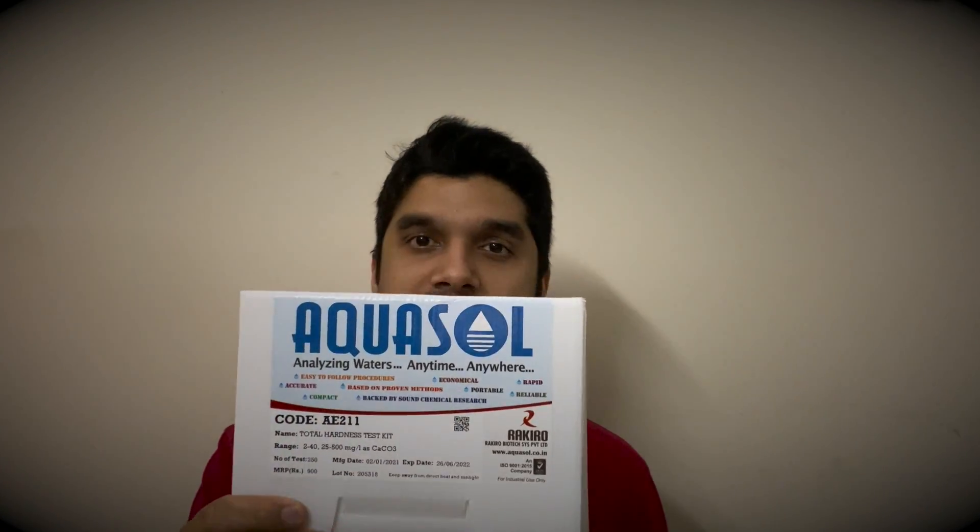I purchased a test kit from Amazon called Aquasol. It's easily available on any website like Amazon or Flipkart. This cost me about 700 to 800 rupees, and I am going to test the quality of water using this kit. Let's get started and measure the total hardness before regeneration.